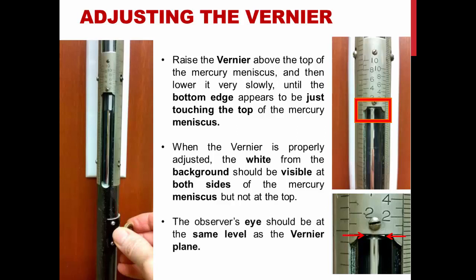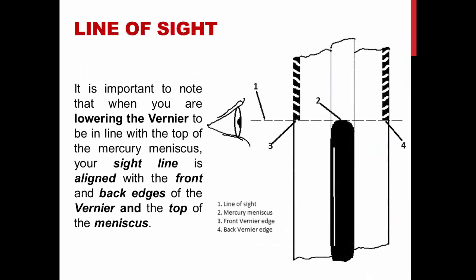When reading the vernier scale, be sure that your eye is at the same level as the vernier plane. It is important to note that when you are lowering the vernier to be in line with the top of the mercury meniscus, your sight line is aligned with the front and back edges of the vernier and the top of the meniscus.